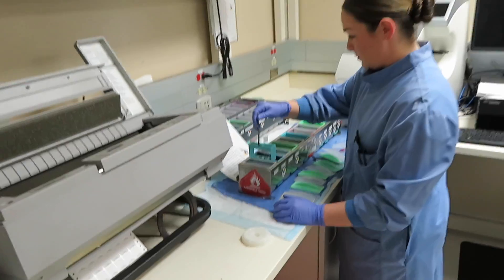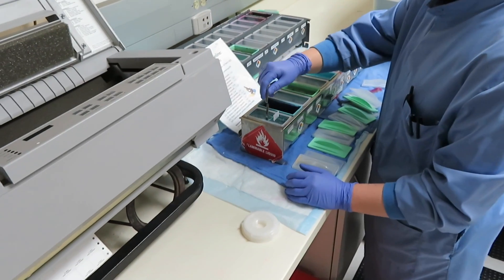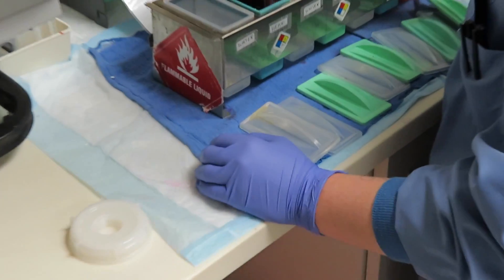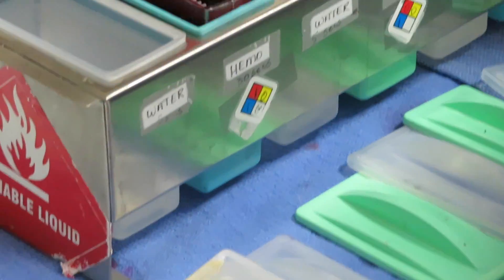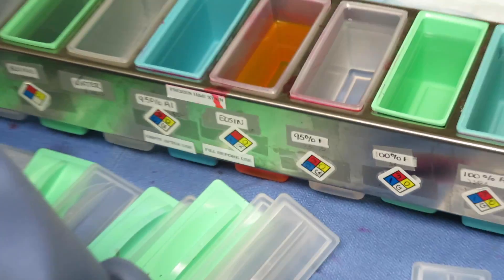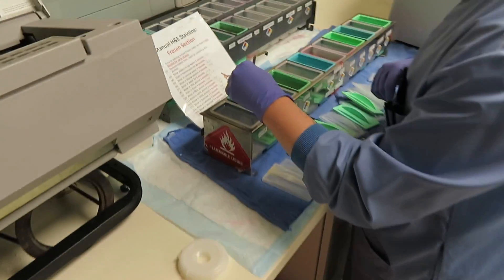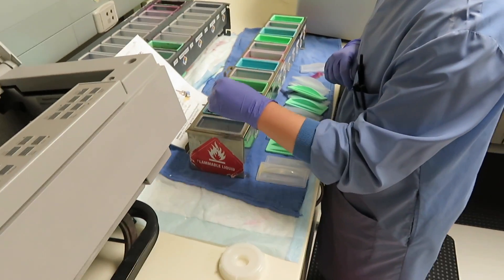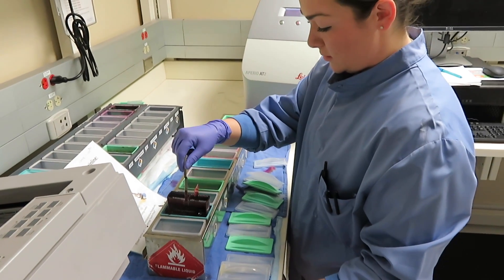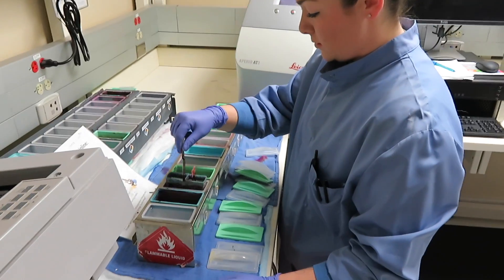We put it in alcohol and run it through our stain line. The two main stains we use are hematoxylin and eosin. Hematoxylin stains the negatively-charged portion of the cell, which is the nucleus, and eosin stains the positively-charged portion, which is more the cytoplasm.